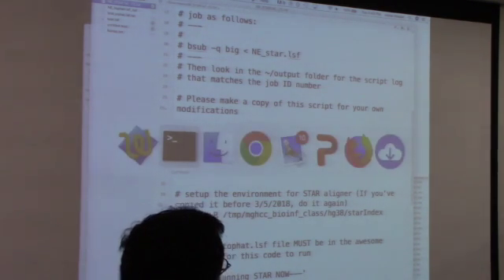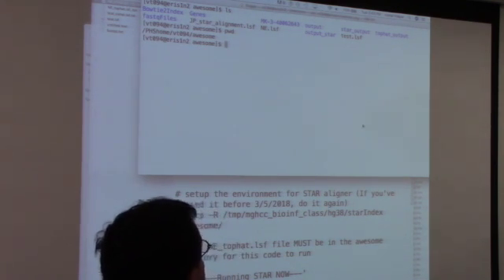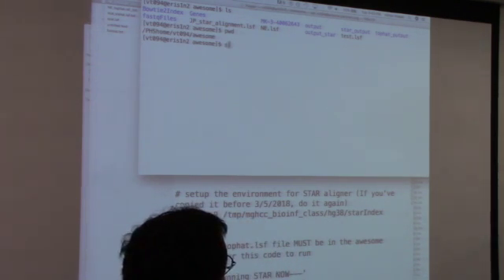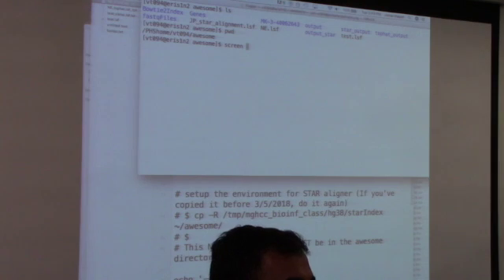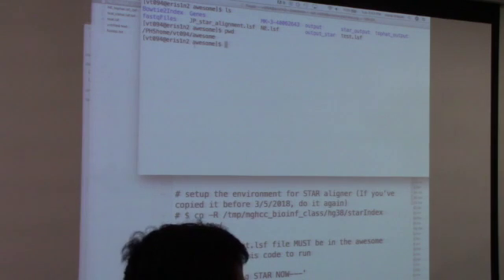Yeah. Here's another interesting thing that you will be using from now till forever. There is this command called screen. That's a very important command. Now, what does it do? This command basically creates a virtual connection that keeps your session open even after you close your computer. So let's say I'm typing out something, so everybody look here.